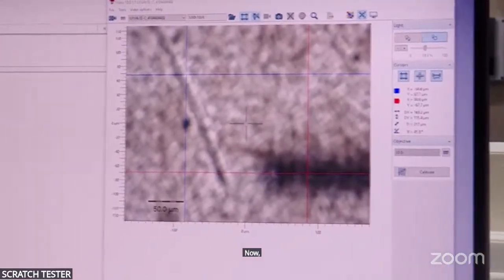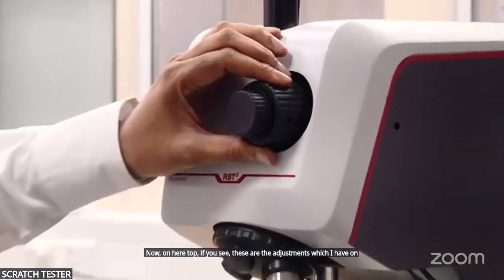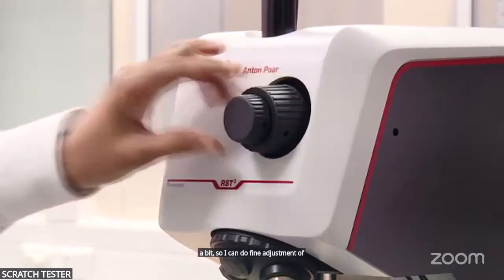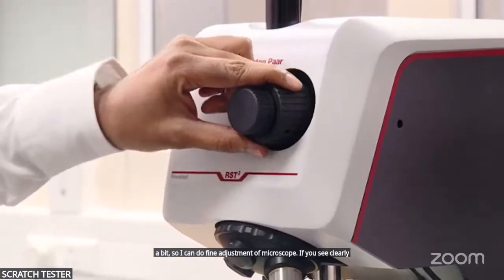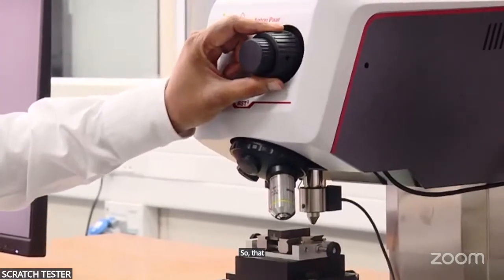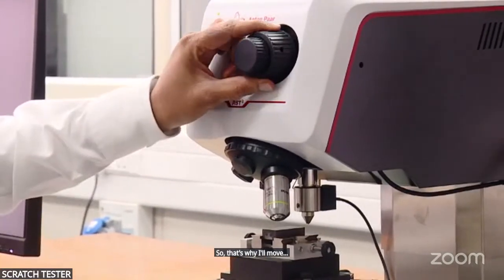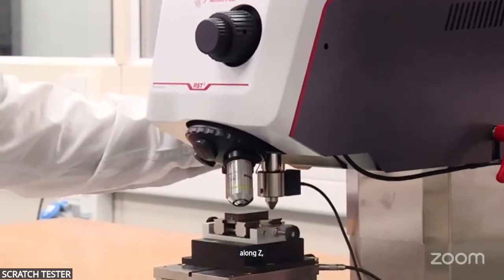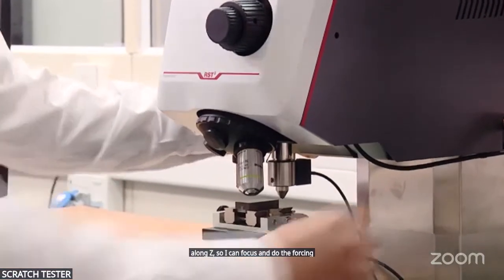On top, these are the adjustments I have at hand, so I can do fine adjustment of the microscope. If you look closely, the head moves up and down using these screws. That's why I go to a slightly defocused area along Z, so I can do the focusing more finely.